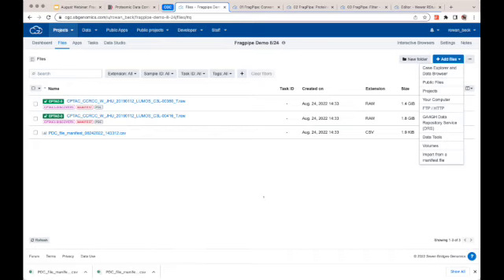Depending on which workflow you're using, the dataset input would be different, right? In this case, the CSV file would have the manifest format, but the data that you're actually going to be using is the raw files from your mass spectrometry. So it will really depend on the workflow and the data that you need, but you can easily upload your own data. There's always a way to do it.